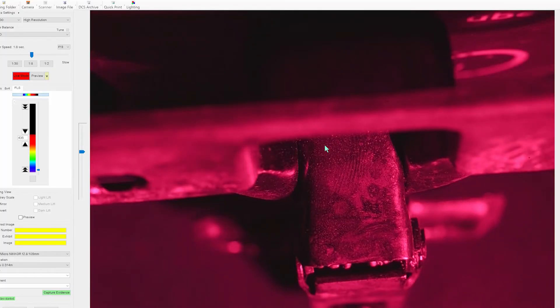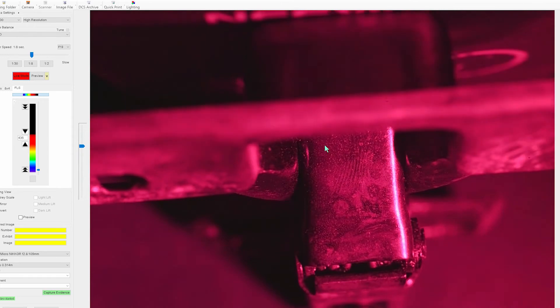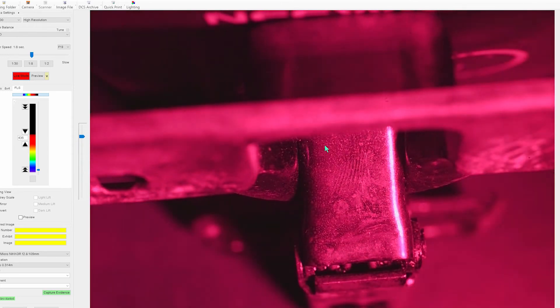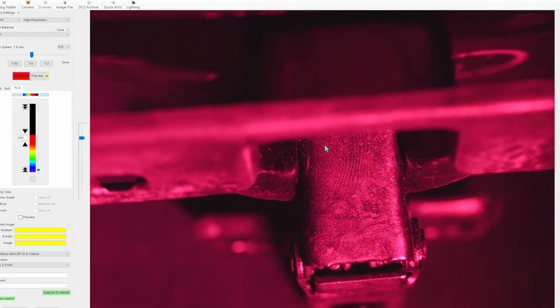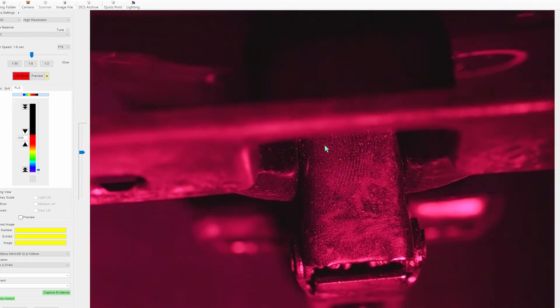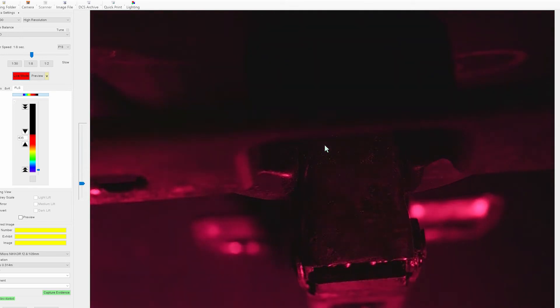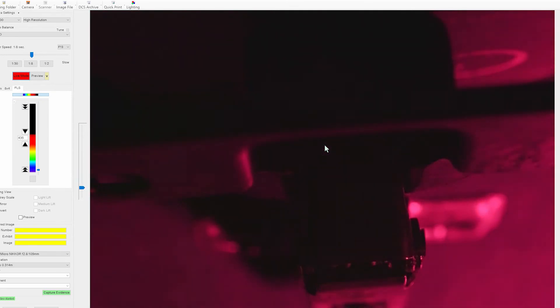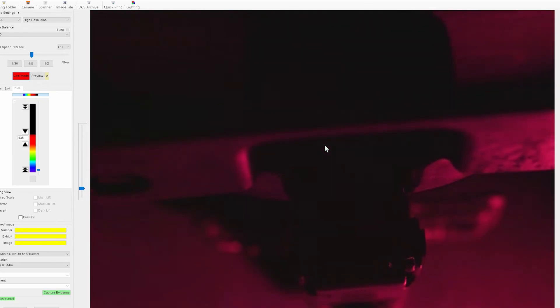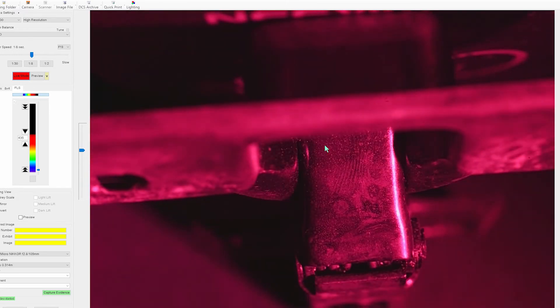Now here with the DCS I'm actually using a technique called reflective UV. Now reflective UV works really well with cyanoacrylate marks, it works well sometimes with latent finger marks, but it's also really useful for recover finger marks as well.